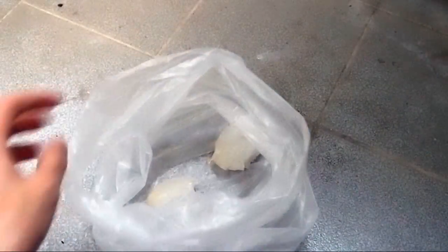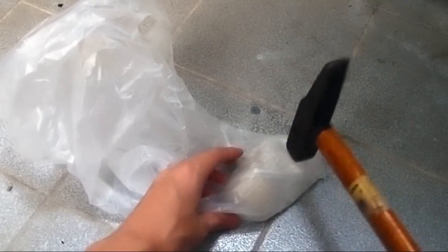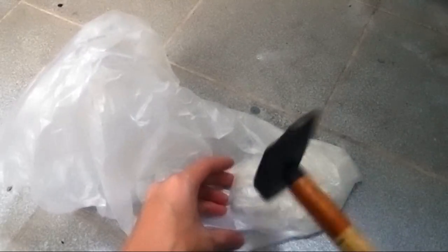I used the two alum crystals to make a new crystal, so I have to prepare some smaller crystals. Put the big crystals into a plastic bag and use a hammer to make them into smaller pieces.